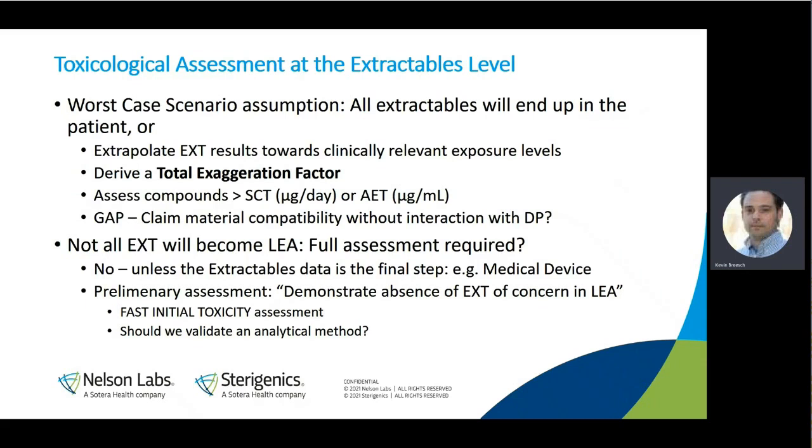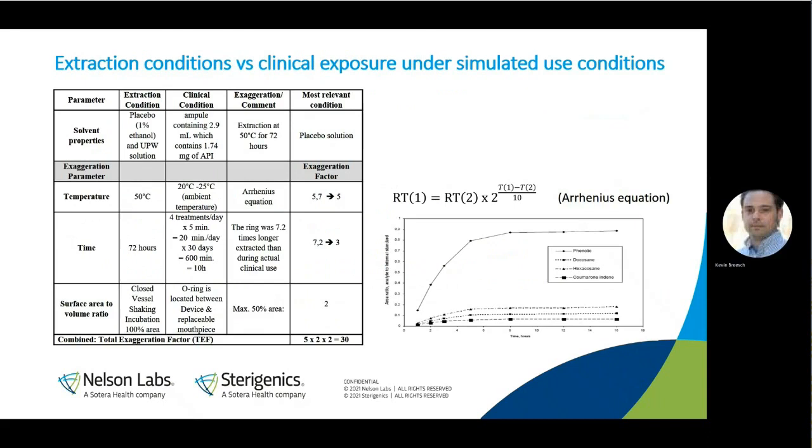Also, an interesting question, should we validate the analytical method? The easy answer is yes, but validating all extractables in the drug product would be very time consuming and costly. So first, let's see if we can extrapolate the extraction conditions to have a more clinically relevant exposure assessment. This is also always a little bit risk-based, obviously.